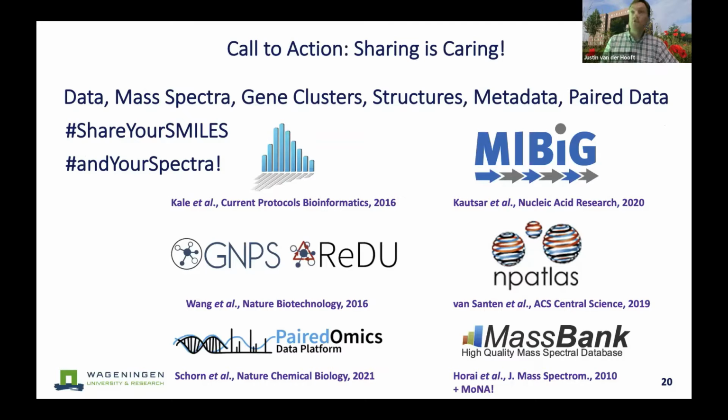I'm getting to the end of this primer. I promised you to come back to these mass spectra. Basically, all these tools that you heard about and many others really depend on annotated data to be able to develop, test and validate, right? So if you are working on your project and you get a chance to share your data, your annotations, your metadata with the scientific community, do it, right? Share your SMILES, both in real life and from the molecules you annotate, and share your spectra, right? My group and other groups will be really happy, right? And thankful to you.